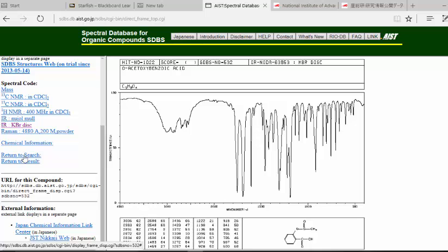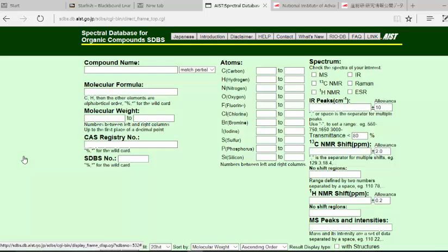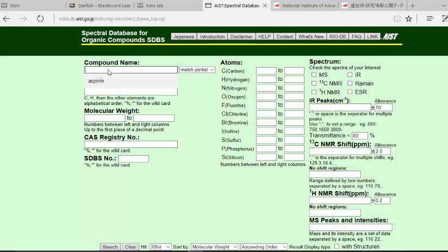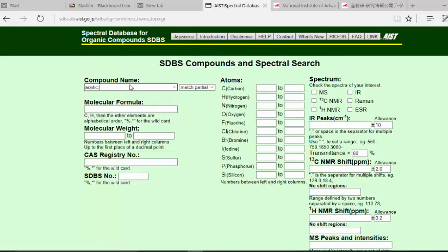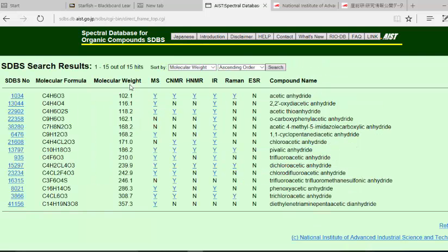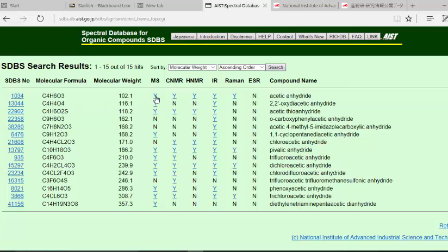We go down here to return to search. That takes us back to the beginning. Now I can look up, I can type in, if you look for acetic anhydride, you can find that here.